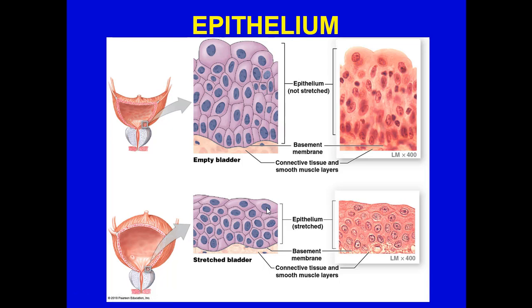Now, this is sometimes harder to get in a microscopic slide because unless you freeze them instantaneously when they're stretched out, it's kind of difficult, but you can definitely tell the difference because they are rounded, and you'll see there's sort of a non-set arrangement. As always, with all epithelium, you're going to have a basement membrane there.